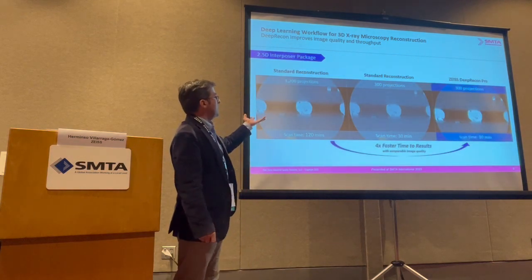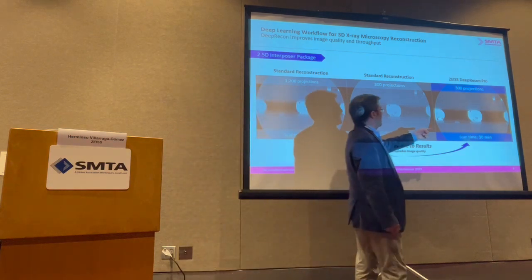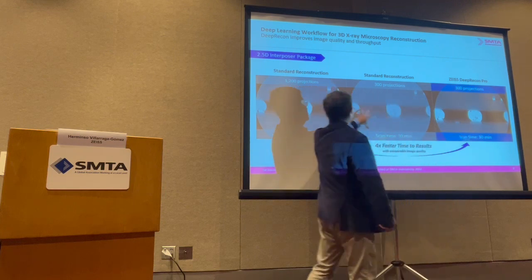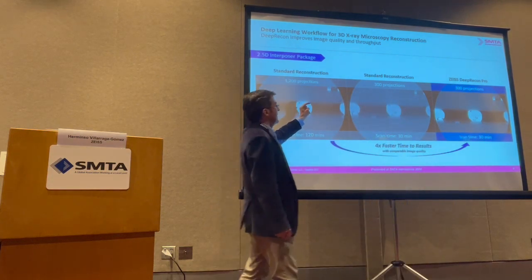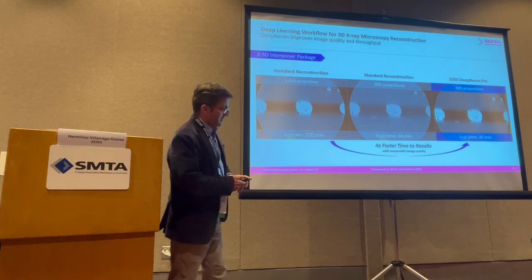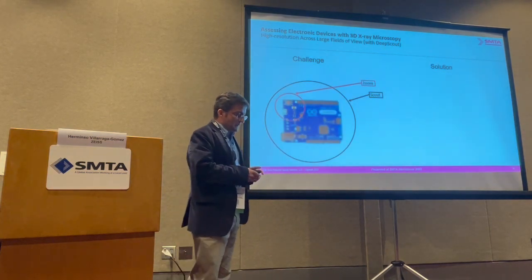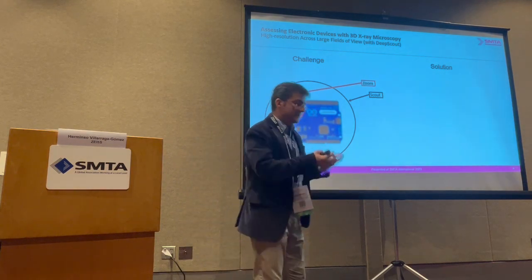And an example for an electronics component in which you can see that the contrast to noise ratio is much higher here as compared to even what is here at the beginning with the full set of projections. And if you reduce the projections with the FDK, the data start getting lost in the noise. Okay, so that's if you try to do improvement in quality and scan time by using deep learning to do the reconstruction.